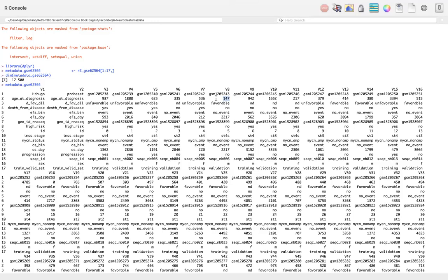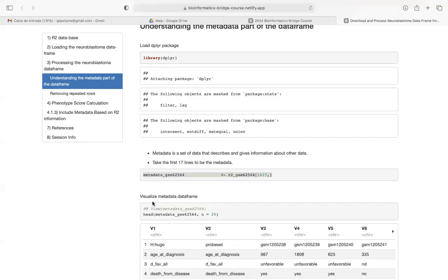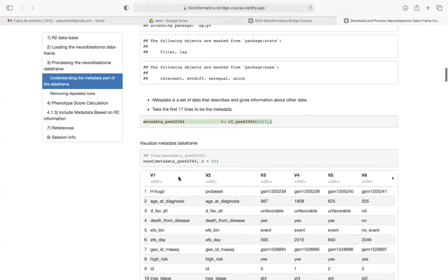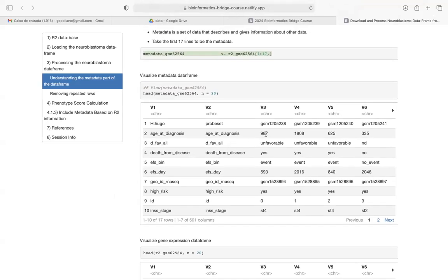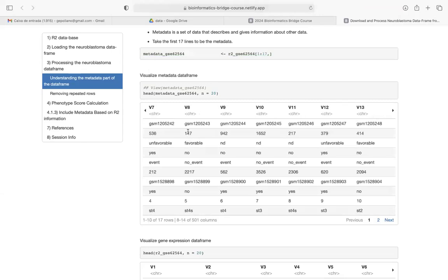Because my brain doesn't know here if this is transposed or the other way around. I hope that I'm saying that correctly. Okay, so that is what the metadata is. We just looked at the metadata, right? The 900, the 1800, 600, 300, and so on. Okay, so let's actually find that 150 days old baby.